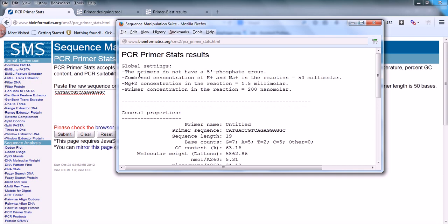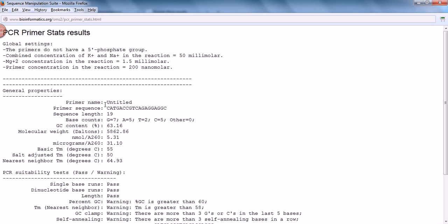The global settings: the primer does not have a five prime phosphate. The magnesium ion concentration in the reaction should be 1.5 millimolar and the primer concentration required is 200 nanomolar. You can see many useful data will be given by this site. Once you get this data, the primer name is untitled, length is provided, the number of G, A, T and C are provided, GC content is provided, everything is provided, and molecular weight is provided.